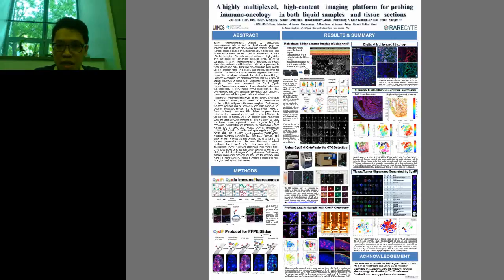These things can go not just for quantitative study, where we show just 10x images, but we can also do something with even higher resolution. Here we show high content imaging done on a confocal microscope, where you can do 60x images. Now you look at one single cell and you can probe all the different subcellular localization proteins, as well as some phosphorylation signals, at once. So that's our advantage in using this highly multiplexed imaging platform.